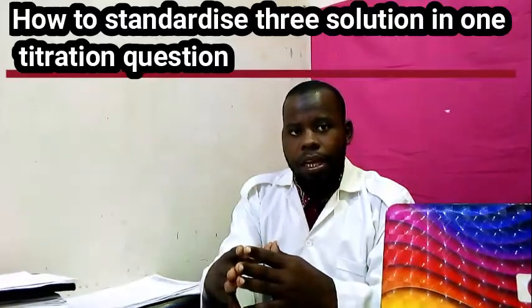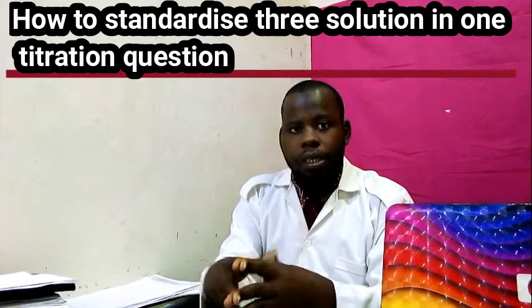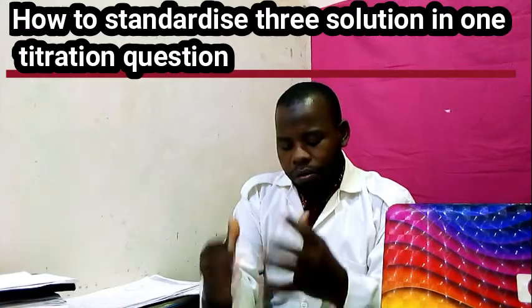2020 Paper 3A Chemistry Practical. This was the Form 6 examination. So how to standardize this? That is our topic. In order for the student to perform this question well, and you are the technician or the teacher, you need to avoid the difficulties of disturbing the solutions. After preparation of potassium permanganate, you have to put it aside.